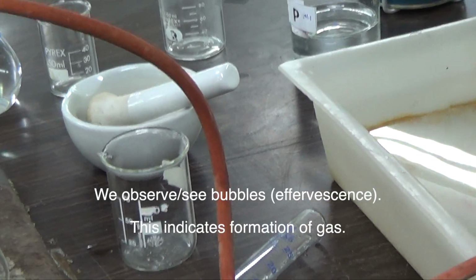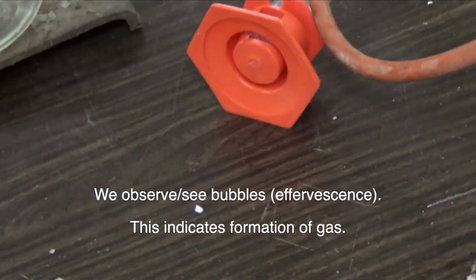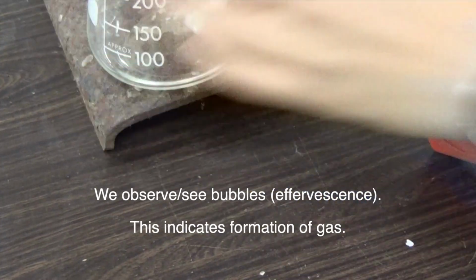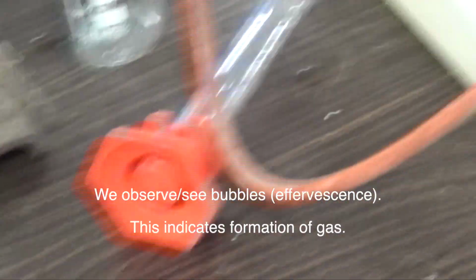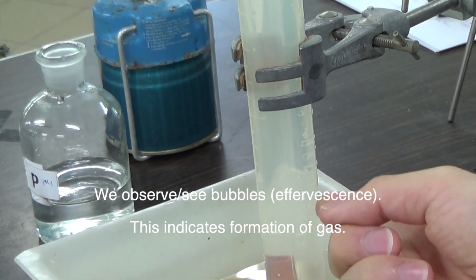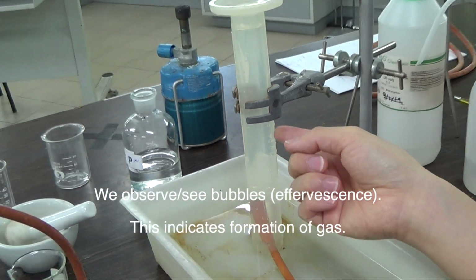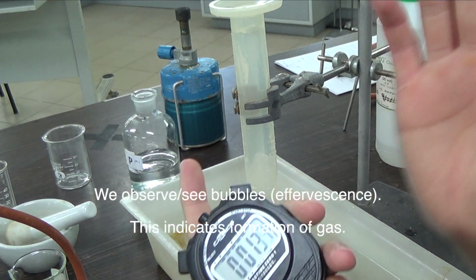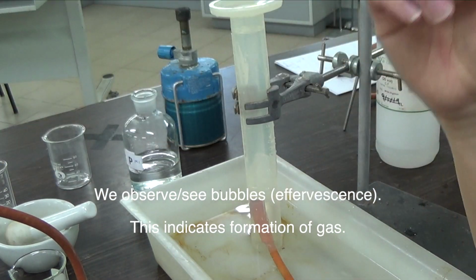So it's fizzing. Not very clear actually. And what you could also see is there is bubbling, because the gas is being collected. It's actually pretty slow. I should have started timing just now. I have to start timing the moment I added them in.